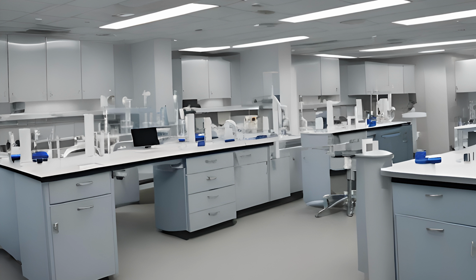These highly reactive chemicals, if they are exposed to a flame, can explode. A lot of laboratories have to maintain a certain humidity level because of this. Having a certain level of humidity in the air will prevent these chemicals from evaporating into dry air. If they evaporate into dry air and fill the room with flammable fumes, that can cause an explosion or a fire. Your SDS is going to be one of the sources of data that will help you prevent that from happening.